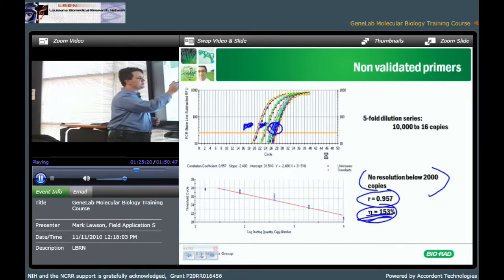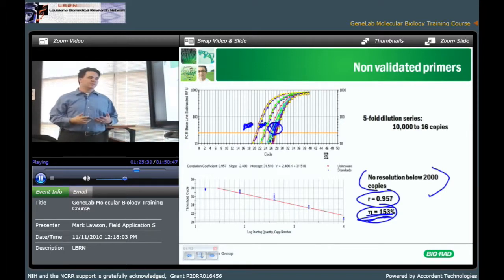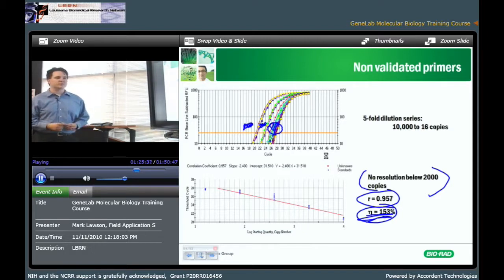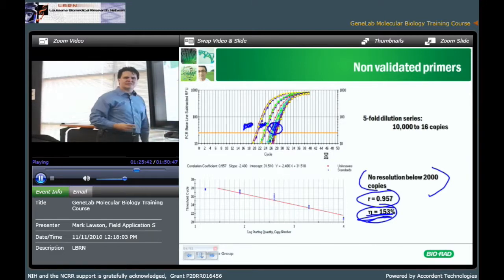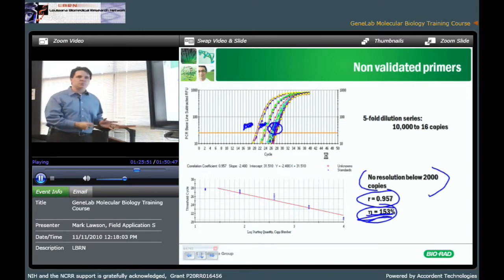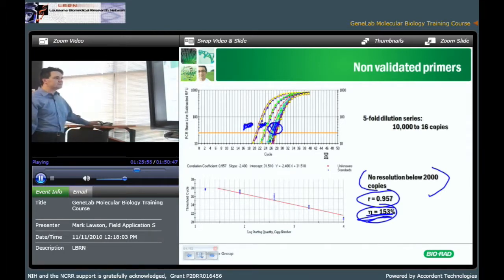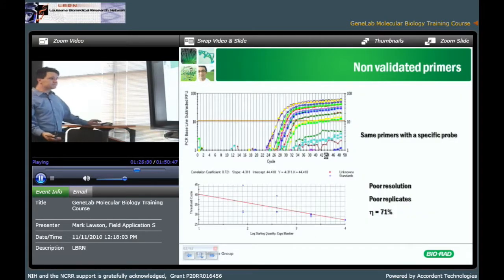But then as you start collecting your samples, you find that even your negative controls, your uninduced or your control population, vehicle treated only, are also getting CT values around 26. And you say, gosh, they're all expressing this cytokine even when I don't induce them. Right? So this is why we have to validate not a single point, but a full range of inputs. We need to know across what range is this assay usable. And we want to do that quickly.